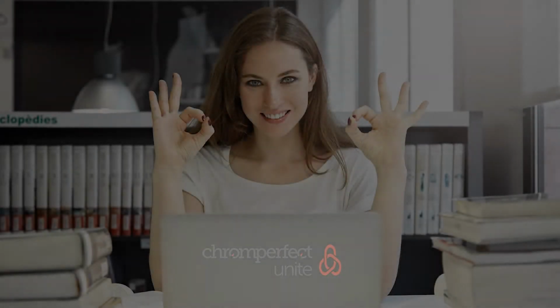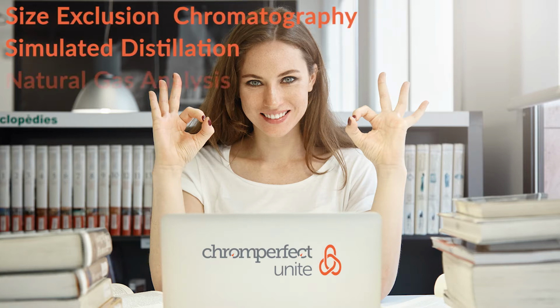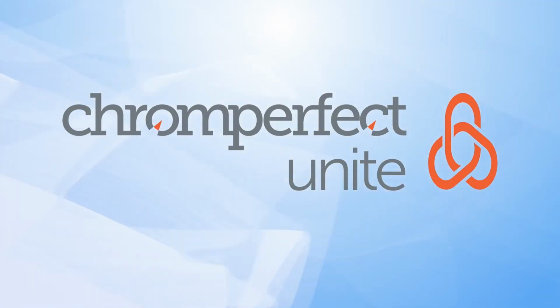In addition to standard chromatography analysis, Chromperfect Unite also supports specialist applications, including size exclusion chromatography, simulated distillation, natural gas analysis, chemometric modeling. Unite your chromatography network today.